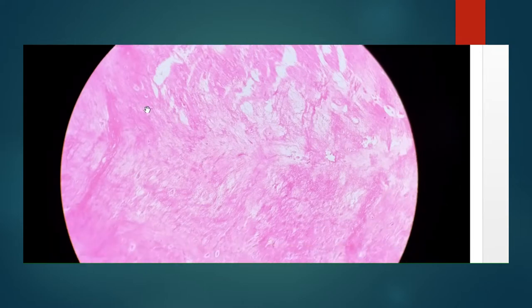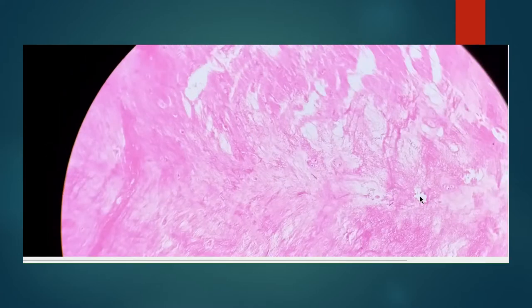Occasional chondrocytes can be seen. Let me show you that. Here you can see occasional chondrocytes, and rows of chondrocytes are present. Can you identify any perichondrium? No perichondrium can be seen in this particular structure. Here you can identify the chondrocytes. Let me make it a little bigger. Yes, here you can see that. These are all the chondrocytes. These rows of chondrocytes can be seen, and they are scattered, very rarely seen.